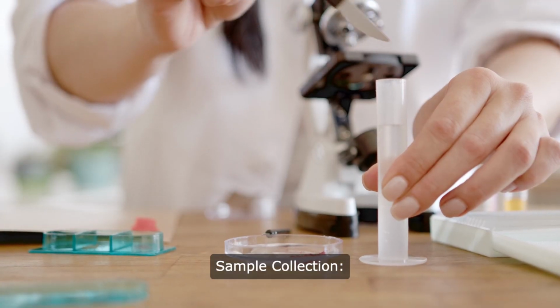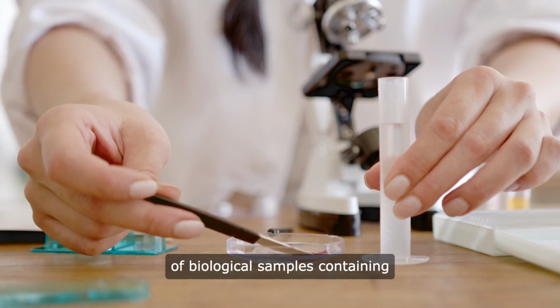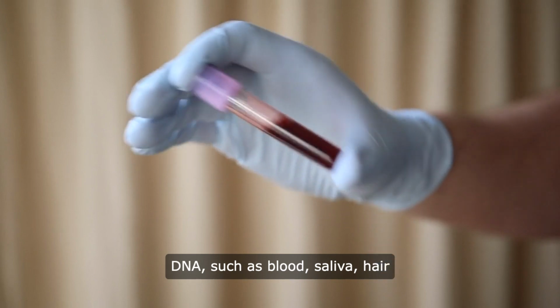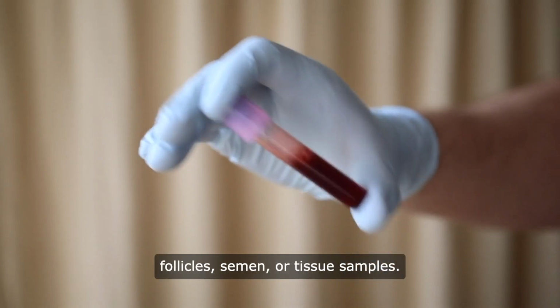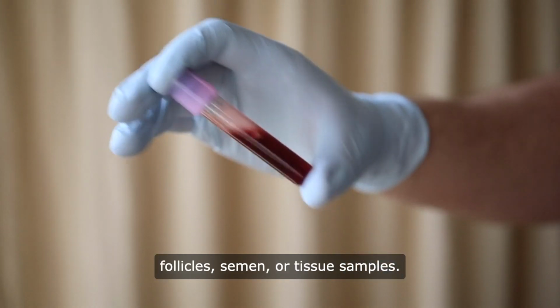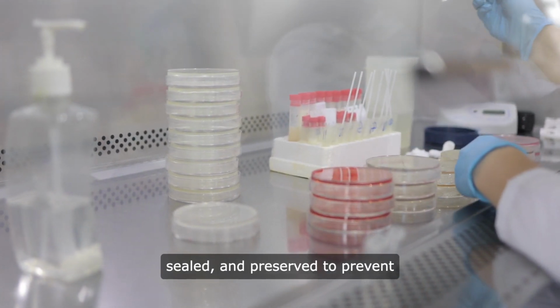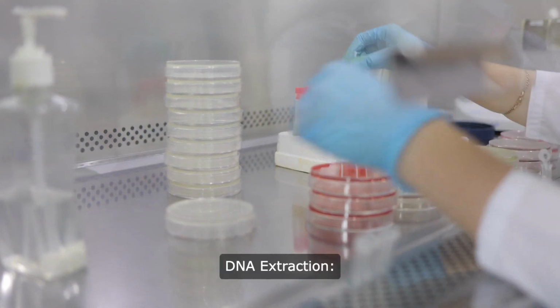Sample collection. The process begins with the collection of biological samples containing DNA, such as blood, saliva, hair follicles, semen, or tissue samples. Samples must be properly labeled, sealed, and preserved to prevent contamination and degradation.